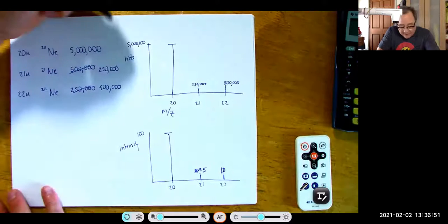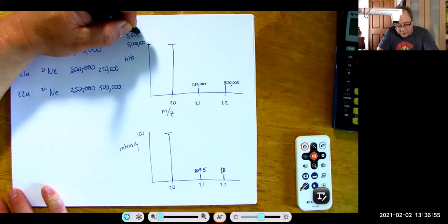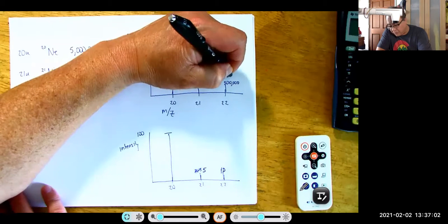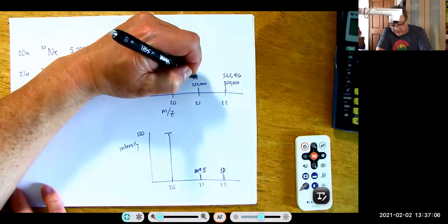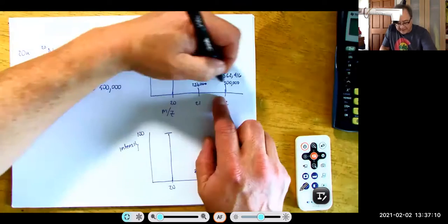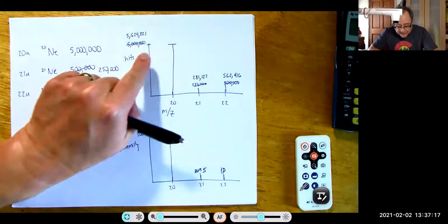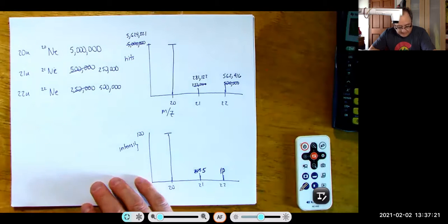and it's not going to be 5 million. It's going to be like 5,624,321. And this is going to be 562,416. And this one's going to be 281,122. Those are the real numbers you're going to get. And it gets messy. So you take this data and turn it into this, and you arbitrarily set that guy to 100. So that's the real data you get.